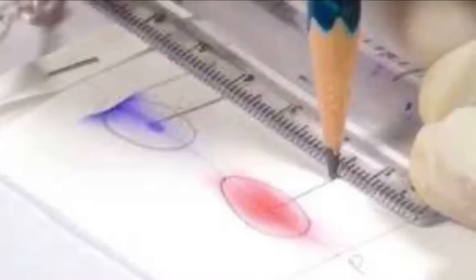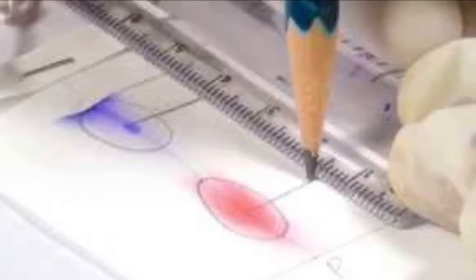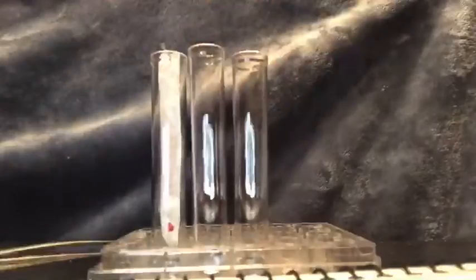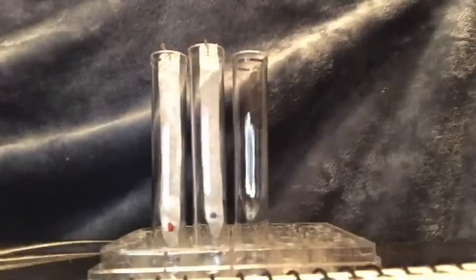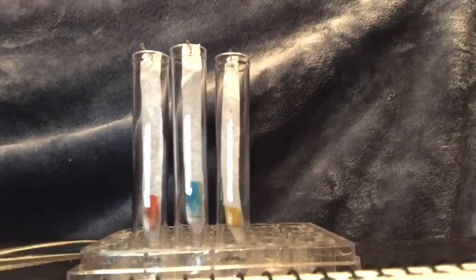For this experiment, I was able to investigate and understand the common use of paper chromatography, where we will isolate food dyes to see the separation of mixtures and to monitor the progress of a certain reaction. This will allow me to identify what compounds are present in the given mixture. This will also help determine the purity of a substance and difference in polarity.